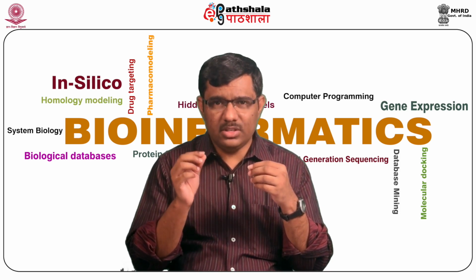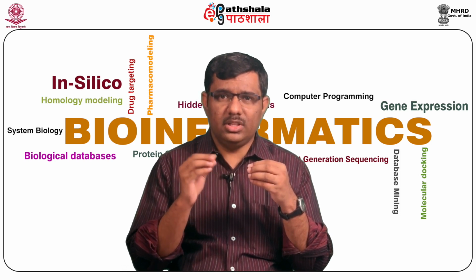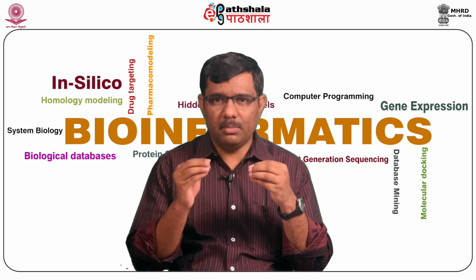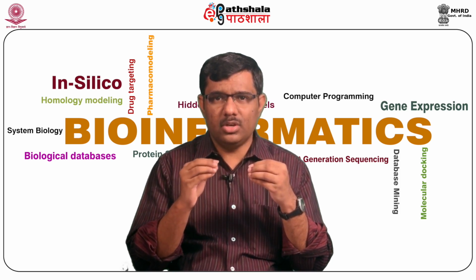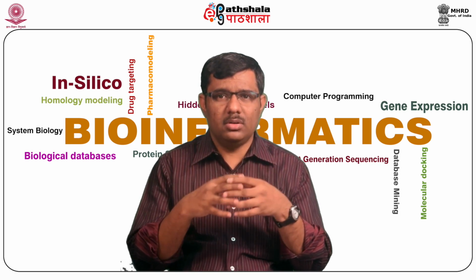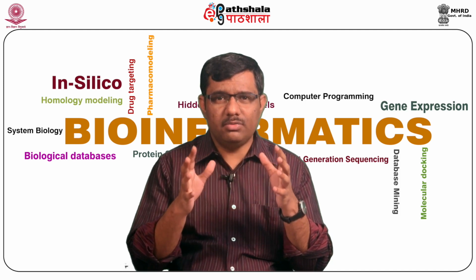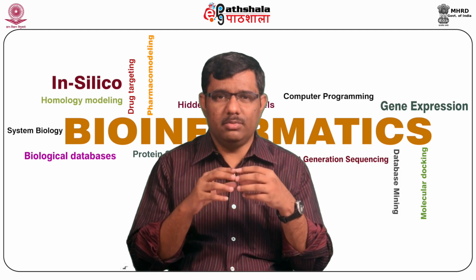Hence it is essential to check the correctness of the overall fold, structure, or errors in localized regions, and stereochemical parameters like bond angle, bond length, geometry, basic geometry parameters like dihedral angles, backbone conformation, and the Ramachandran plot. All this information can be obtained from the validation report at the RCSB website.